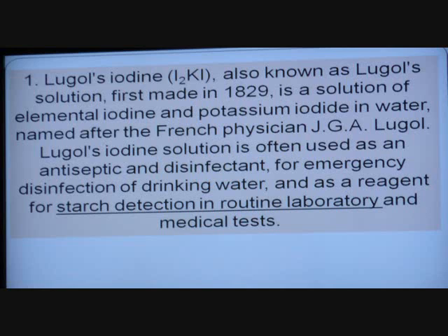But I underline how we're going to use it as a starch detective device. It's going to need your camera. Like some folks take pictures. I think they started. So I'll move on because I can go back if you need to.